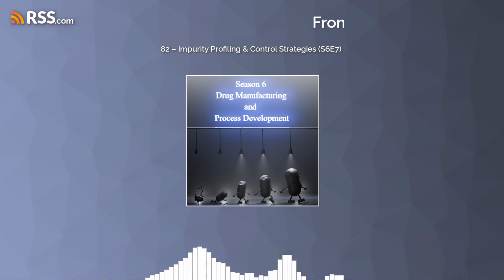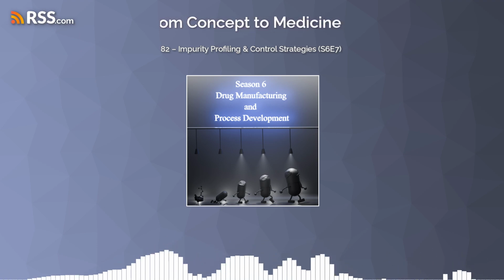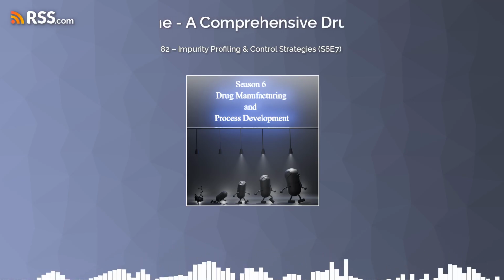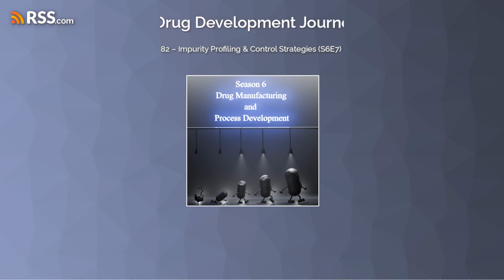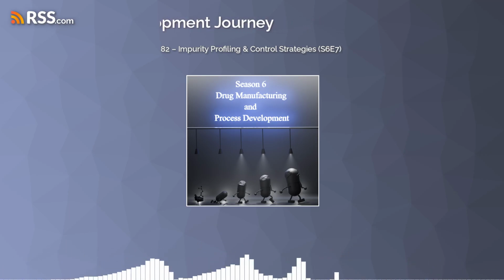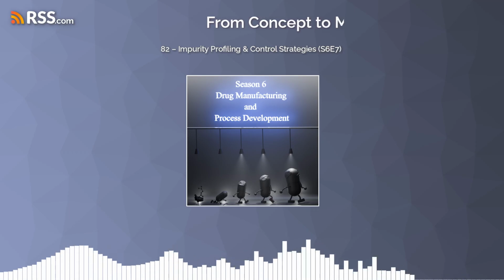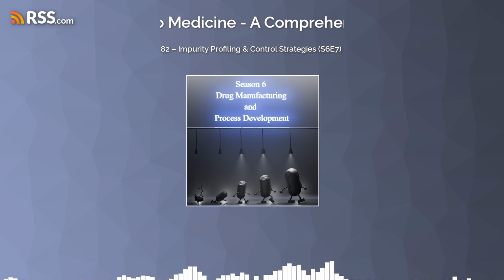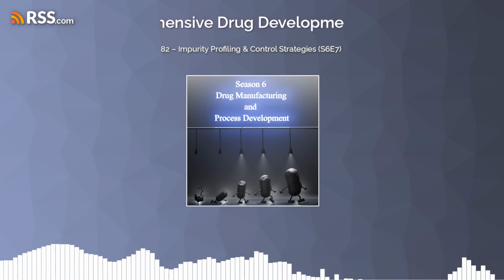But the challenge with ICP-MS is that you often get interferences. This means one element, or ion, can mask the signal of another one because they have similar masses. Like trying to pick out a single voice in a crowded room. Exactly. A classic example is argon, which has an atomic mass of 40, interfering with calcium, which also has a mass of 40. So how do they differentiate? How do they tell those apart? Well, they have some clever tricks up their sleeves. ICP-MS instruments often have collision or reaction cells to deal with this problem. Okay, break those down for us.